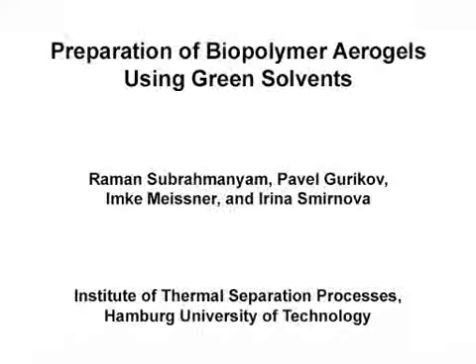The overall goal of this work is to visually demonstrate the production techniques of biopolymer aerogels using amidated pectin as a model biopolymer and water, ethanol, and carbon dioxide as solvents.